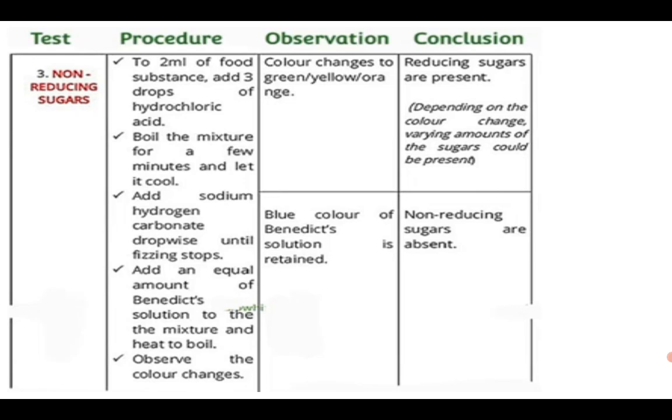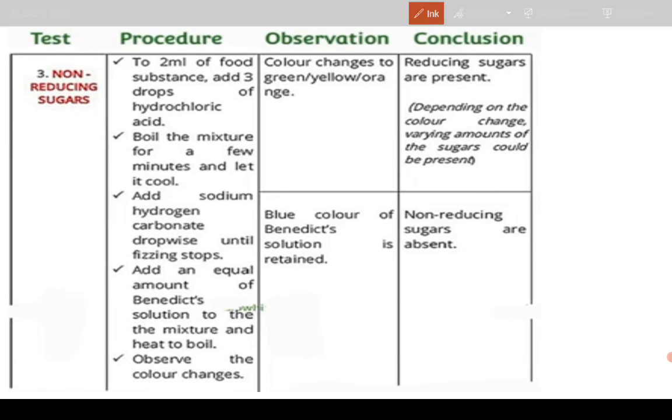All right, another test that you are very likely to be examined on is for non-reducing sugars. In most cases, non-reducing sugars are sugars called disaccharides. An example of a disaccharide is sucrose.